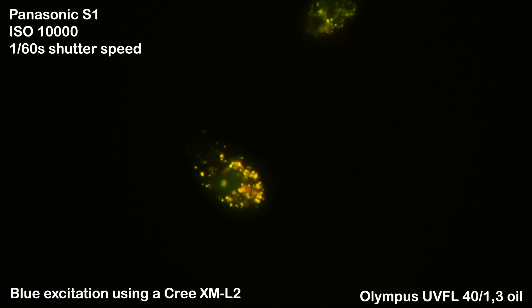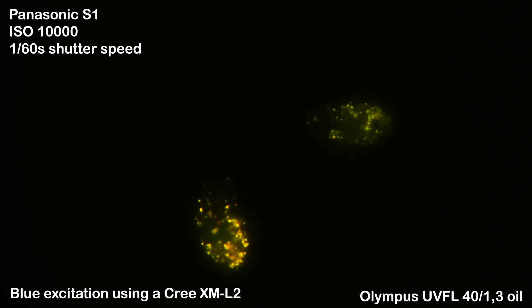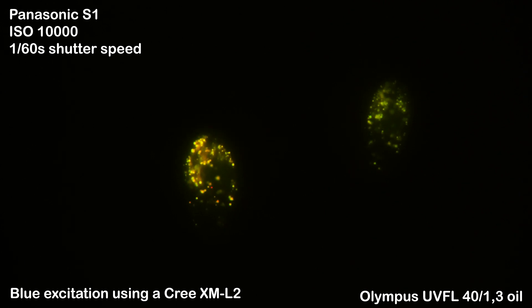I turned off my transmitted light source, switched on my epifluorescent Cree LED, and started recording with my camera. All of the compartments stained by AO now appear in different colors ranging from green to orange to red.